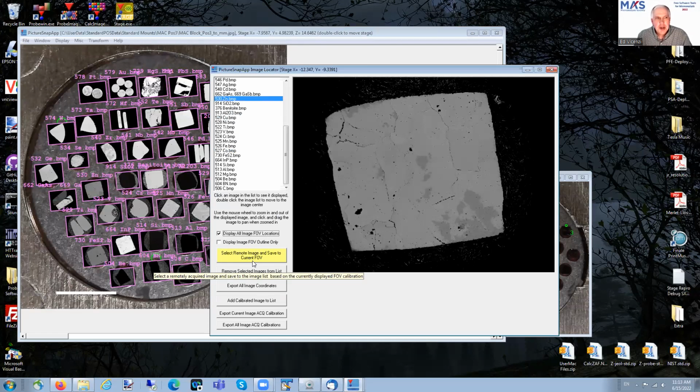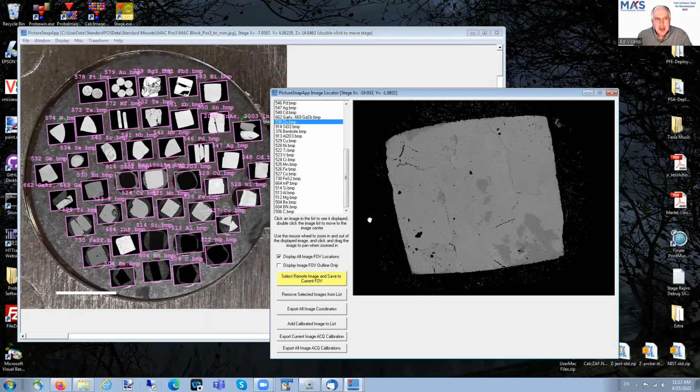Thank you, John. That's a real fantastic time saver. And I think it's really excellent for having confidence regarding your image registration when you're moving between imaging systems, or moving to a higher sensitivity measurement system. Maybe you're going to the synchrotron or whatever. I have so many people that tell me that this saved their butts when they were going from their laser ablation to their microprobe or microprobe to laser ablation. It really allows them to have confidence they can relocate things. I notice in some SIMS, it's pretty hard to know where you are sometimes.